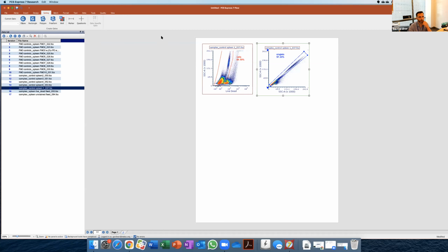And if I click now on this gate, and I select data specific gate, and let's say I move it, let's put it over here, just to be obvious that it's in a different place. Now, if I click on another file, I'll see that it still has the original gate. So all of these have the original gate, except this one that will have the gate moved. So we can do an analysis having gates that are specific for that file.